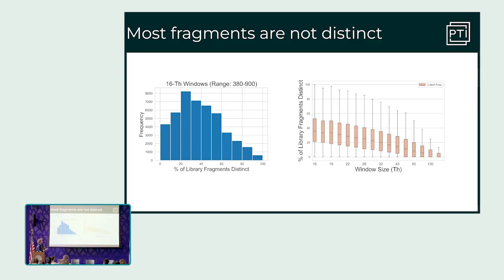And you can say, well, why do we care if we increase the size of our windows? Well, in a single-cell proteomics example, maybe we want to capture more of the ions. So with smaller windows, you actually throw away most of your ions. In the larger window, you can capture a greater fraction of the ions. Or you could increase your sampling rate. With larger windows, you may want to sample your ions or your elution peak more frequently, and that's afforded by using larger windows. And those window sizes are just based on dividing this mass range into these sizes. So we have an exponential increase, and we see that decrease.